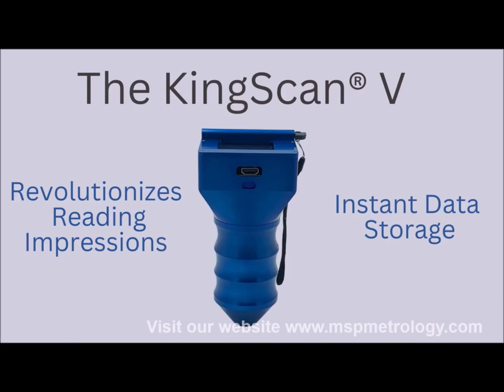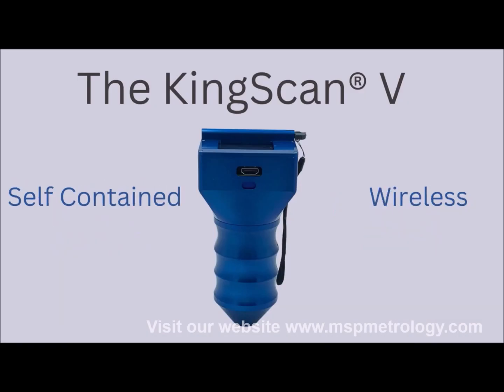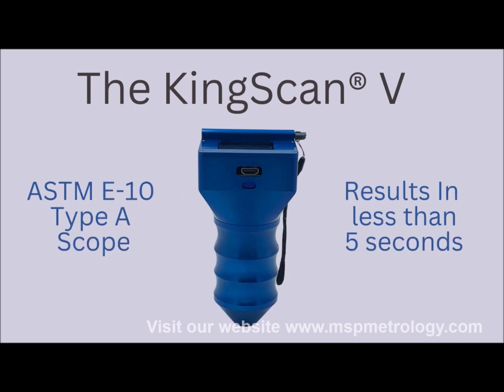The KingScan 5 is a standalone Brinell measuring device with a rugged construction and intuitive menu driven software providing the accuracy and reliability you need.